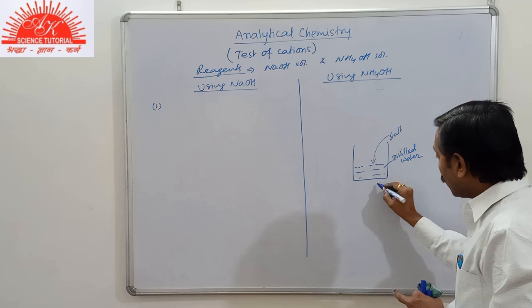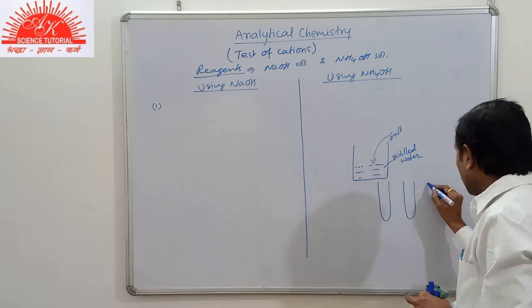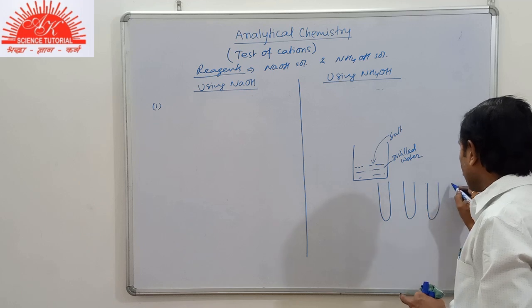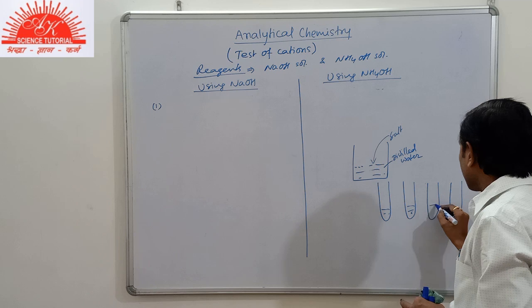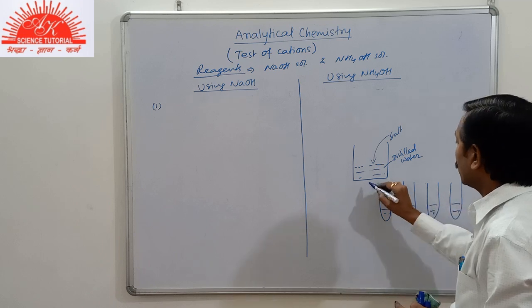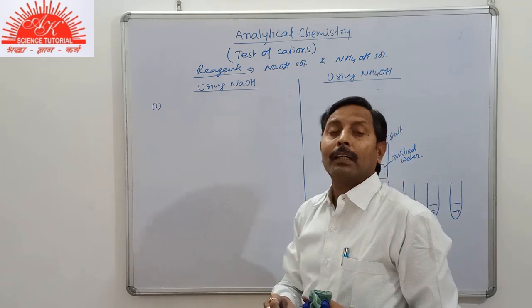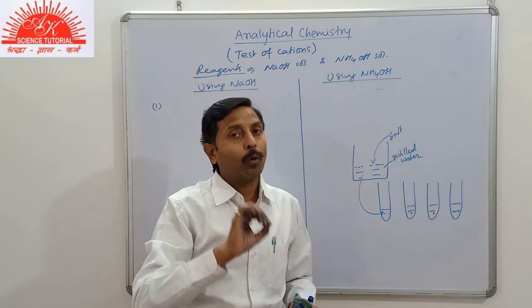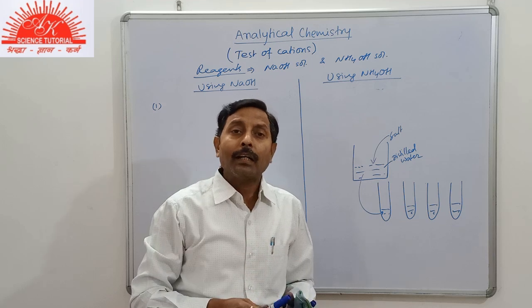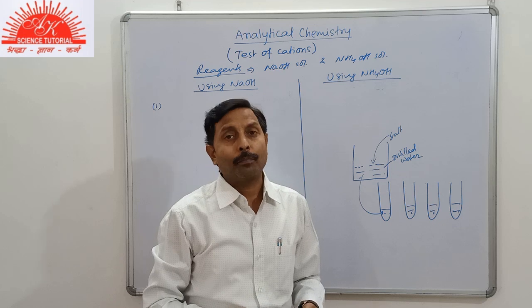Then this salt solution is taken in a small amount in the test tubes. Suppose the test tubes are taken like this. Salt solution is taken here. And then you will add NaOH or KOH dropwise and observe, noting the changes taking place.